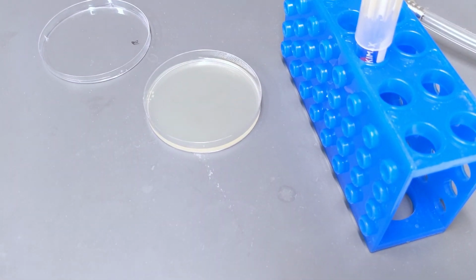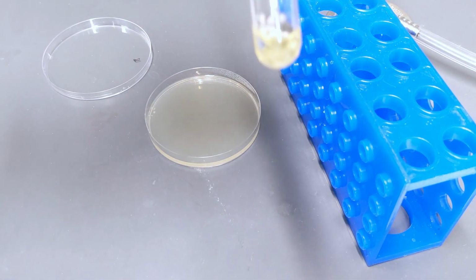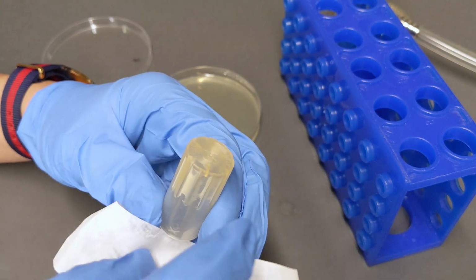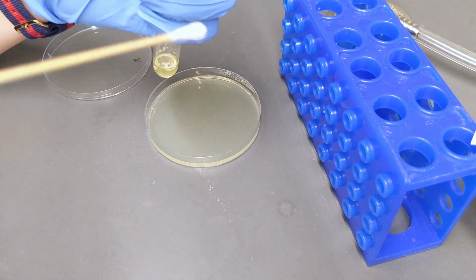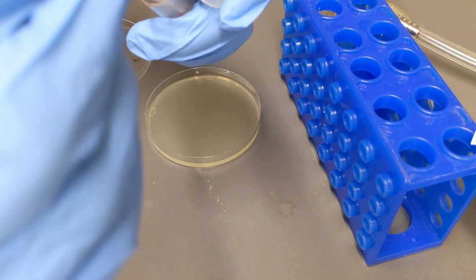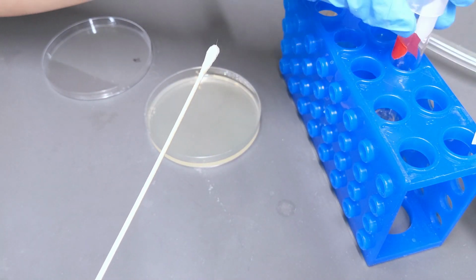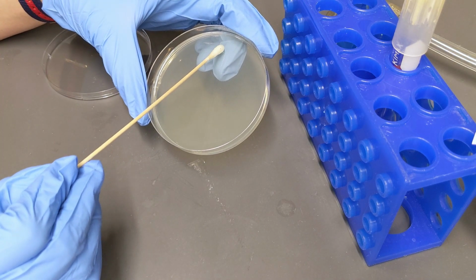This time, we inoculate the LB agar with liquid P. rubens culture using a sterile cotton swab. Here is the liquid culture of P. rubens. And here is the sterile cotton swab. We will dip the cotton swab in the P. rubens culture and draw a stripe on the agar to allow P. rubens to grow in this area.